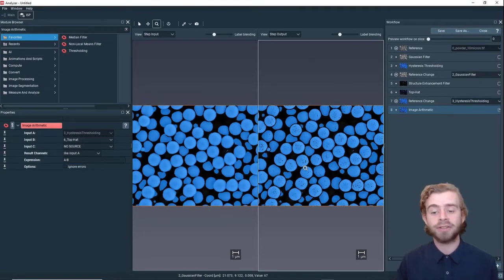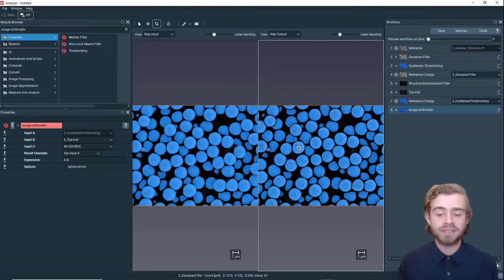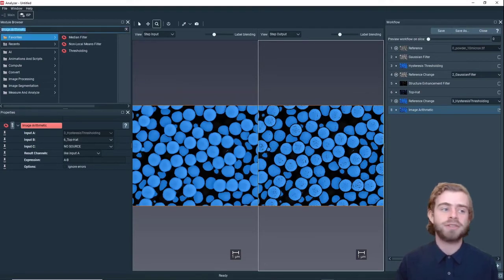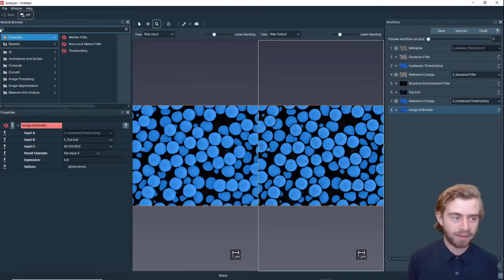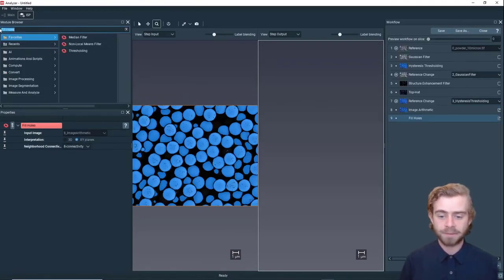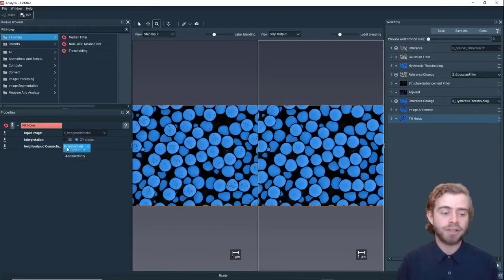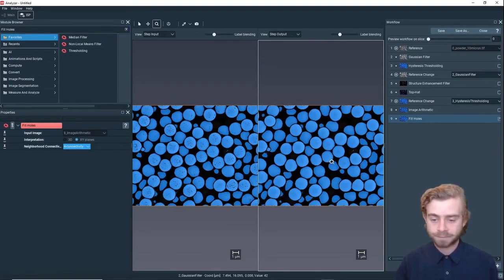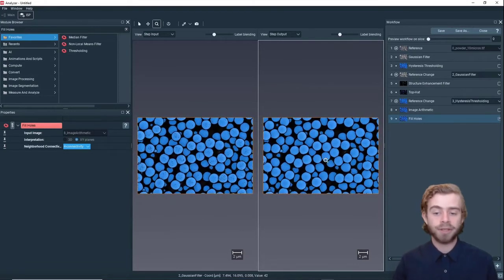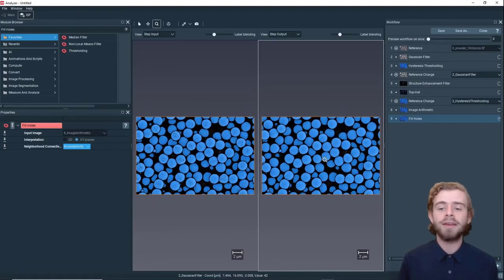Now you can see each particle is separated from its neighbors, but there are also these little bits of noise that are not filled in inside each of the particles. To fill those in we can just use the Fill Holes method. We're going to click Fill Holes and change the connectivity to 4.